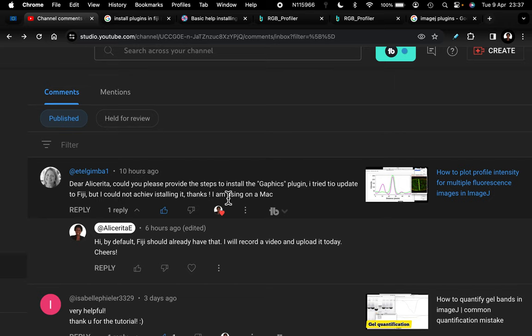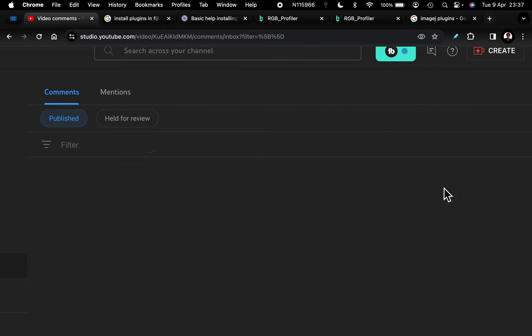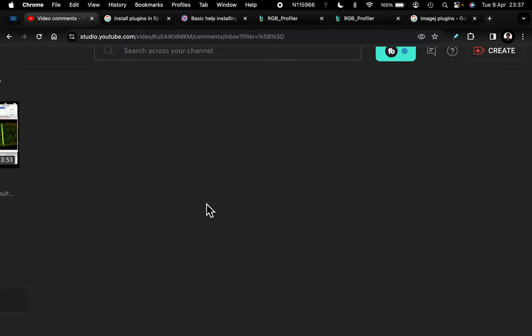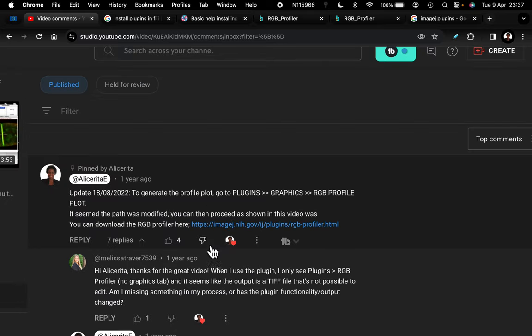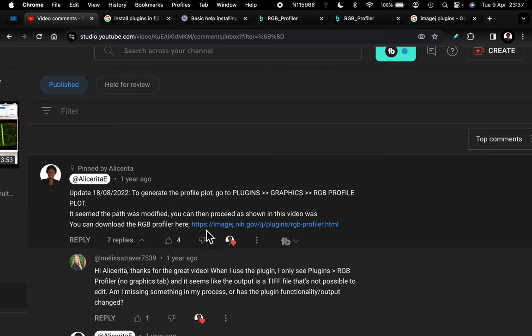The comment was asking how to install graphic plugin to Fiji. Usually Fiji contains most of the plugins, unlike ImageJ where you have to install the plugins. In this video I explained how to use a particular plugin for analysis. I'm going to be using that plugin for today's tutorial. If you have any other type of plugin you need to use, just follow this particular procedure.